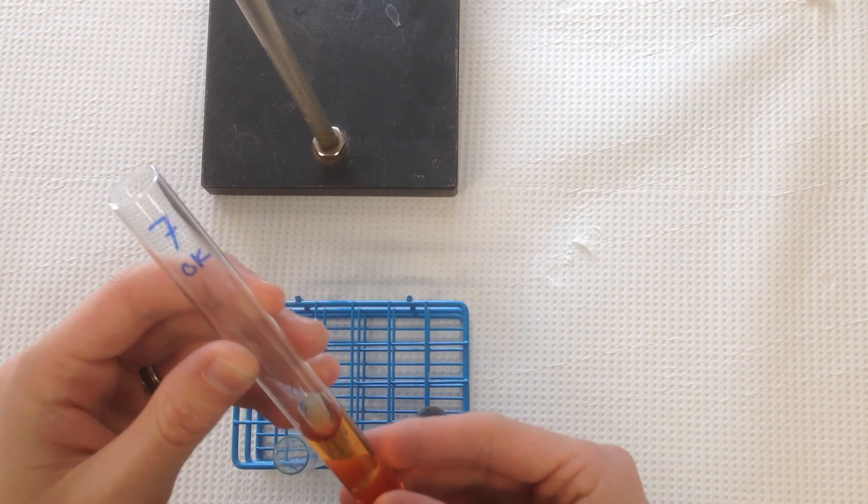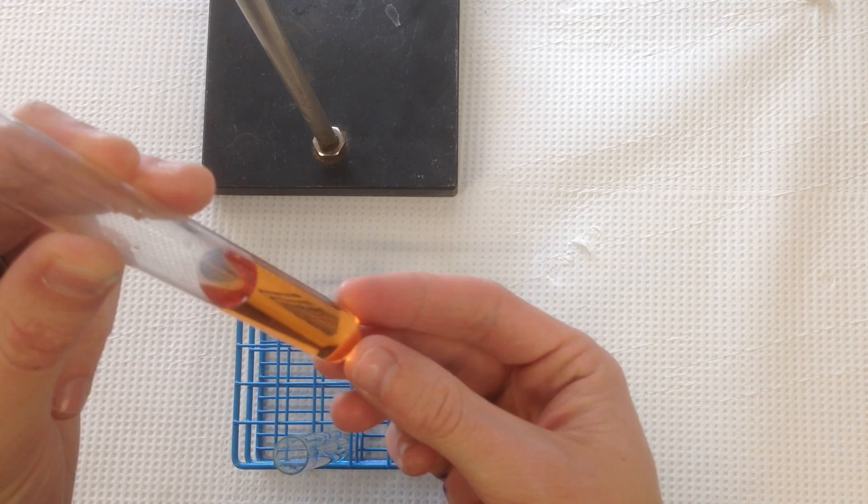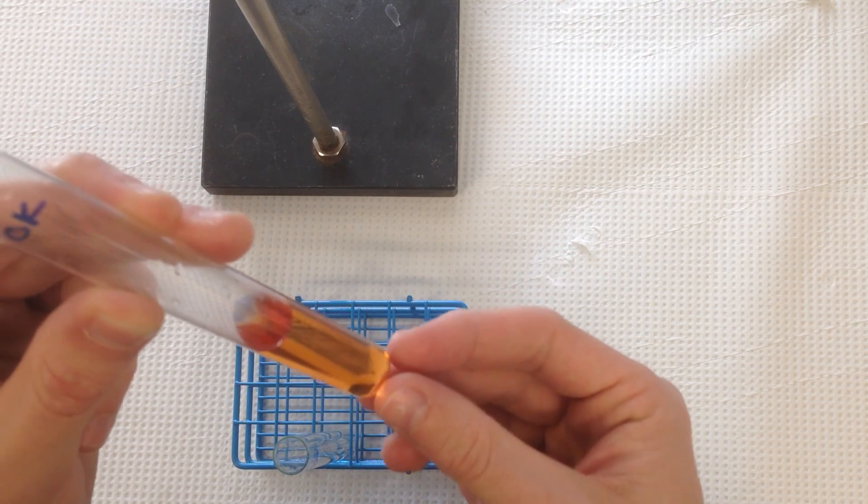For example, here's what test tube 7, which is an equilibrium run — a Part B run — is supposed to look like. It's got this nice, kind of mild, orangish color to it.